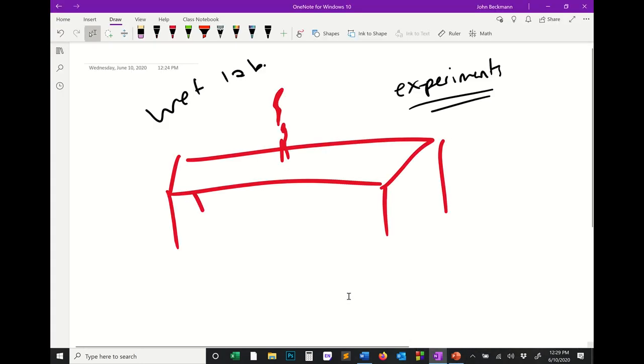You're going to see that there's a difference between book knowledge and knowledge that actually translates to what works in a lab. Producing data, producing figures, and testing scientific hypotheses in a lab through experiments. So what I want to talk about today is the first, most basic fundamental skill set that you need to learn the first day that you walk into a wet lab, a new environment, a new lab where you're going to do some experiments.